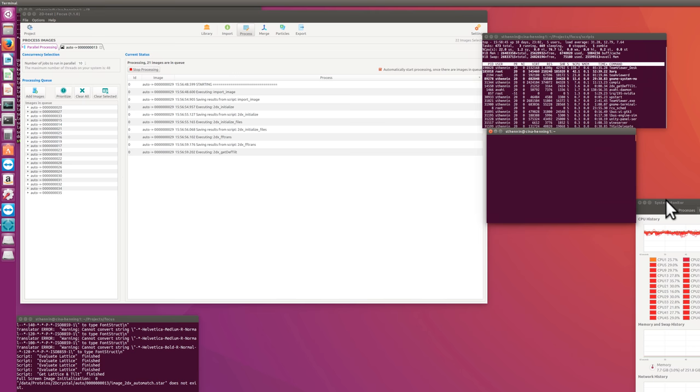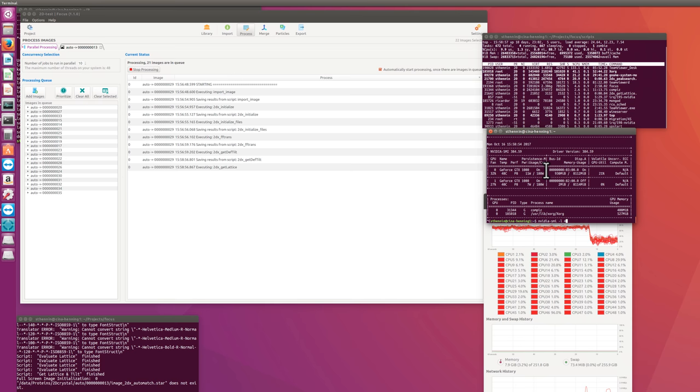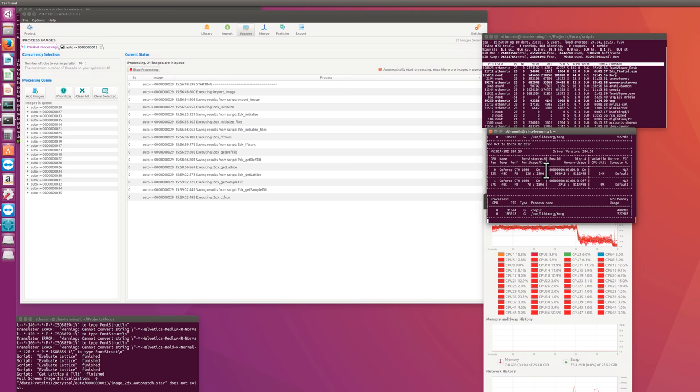And what is this one here? This should be nvidia-smi -l 3, so every 3 seconds it updates what the graphics cards are doing. So now the CTF correction script is done. Oh, CTF correction in stripes, yeah, that also takes time. This was a defocus determination, lattice, sample, tilt, and this runs on image number 29 now. We're just in some random order here.